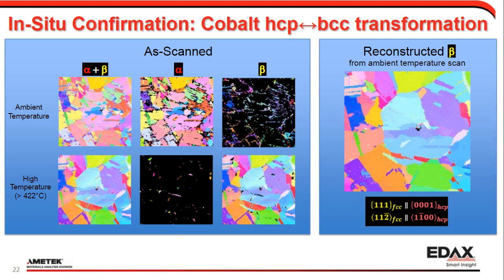So in the set at left, those on the bottom row should match the reconstructed. And you can see it's a good match. There are some differences, but you can see that for the most part, we have recaptured the microstructure, including the twins. So that gives us confidence that what we're doing is working and that our approach is valid.